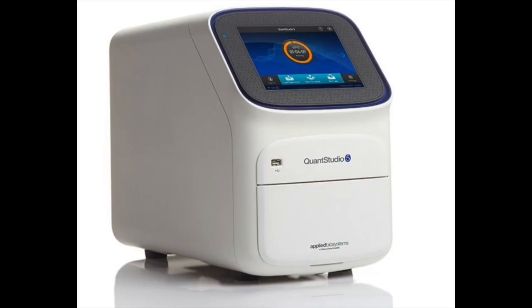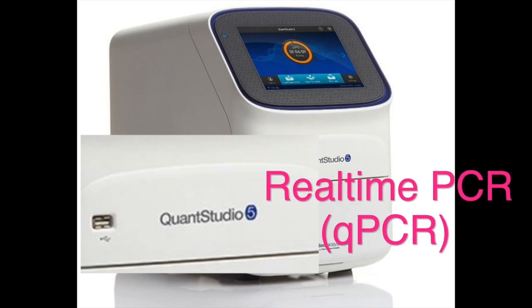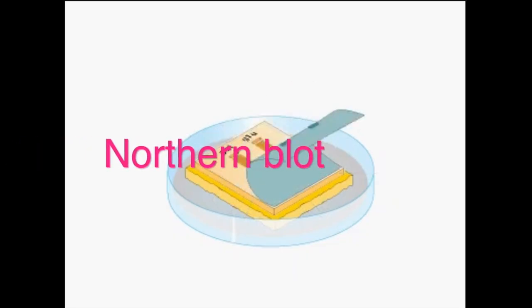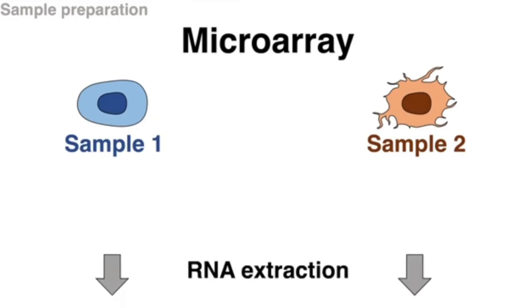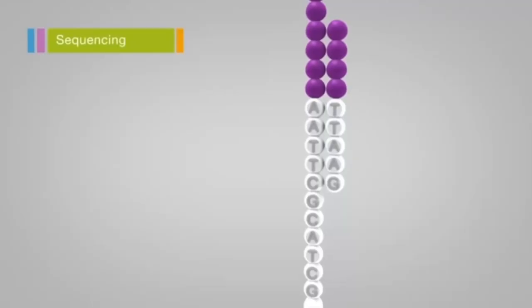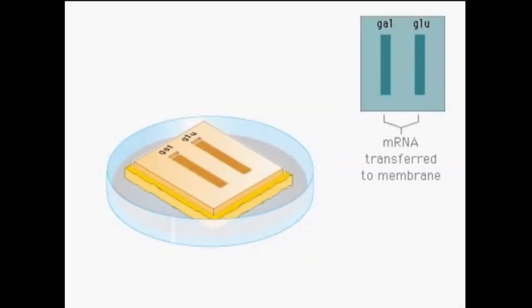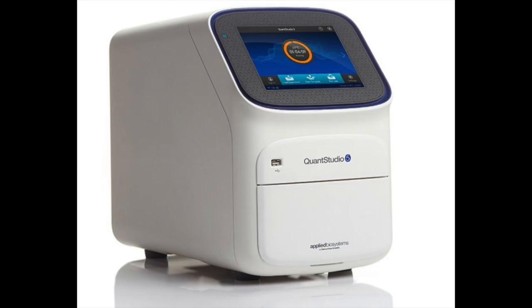The most common ones are real-time PCR. It's also called Quantitative PCR or qPCR. There is northern blot, then there are microarrays, and finally there are RNA sequencing techniques. The technique that you use is going to be decided for you based on your actual research question.